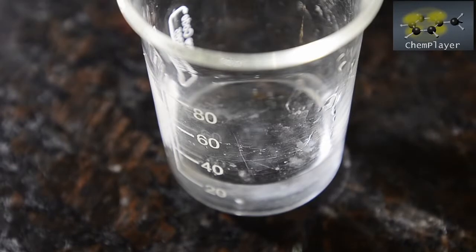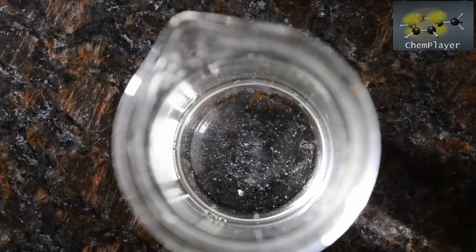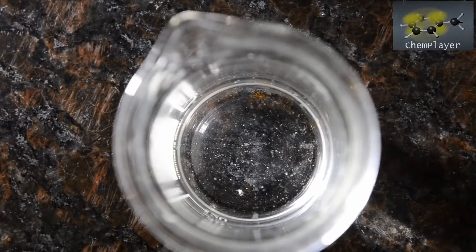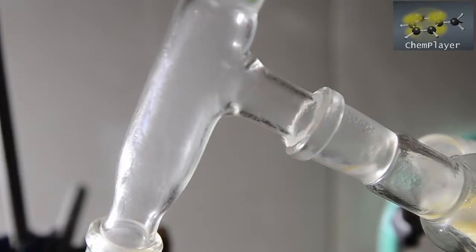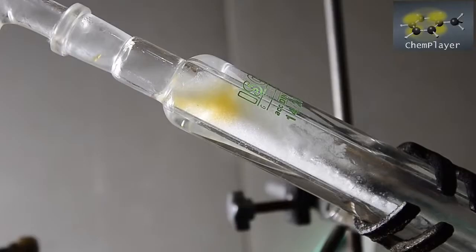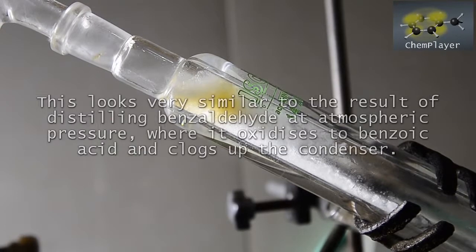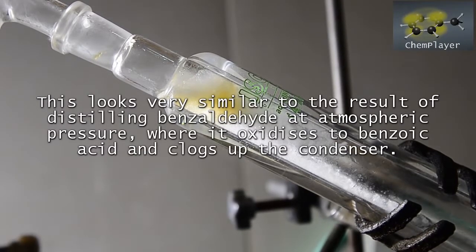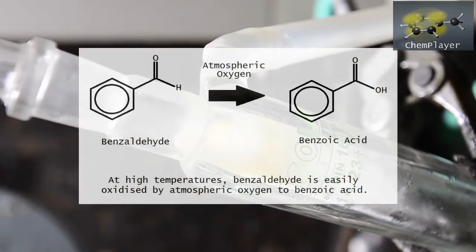Our distillate up until this point is completely aqueous with no separate organic layer, and with a few specks of what looks like benzoic acid floating around. We keep persevering and heating the mixture. But all we're getting is an increased buildup of solid inside the condenser. We've seen this before. This looks exactly the same as what happens when you attempt to distill benzaldehyde at standard atmospheric pressure. The compound oxidizes in air to benzoic acid. And we're pretty sure that's what is happening here.